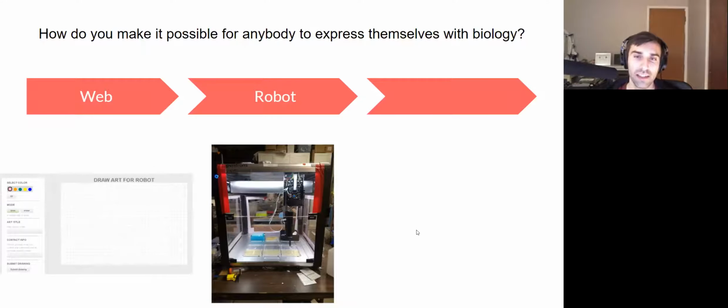That way someone gets back a nice photo of a drawing, and that's really cool. But then they can also spend another hour, maybe in a classroom context, or not if they just want to read about it, asking why all that happened. That's a great start. It's a hands-on experiment for people interested in getting started. But you can also go a little deeper. Perhaps we have some modules that suggest a way to change some code or biology. Do you want that purple? Well, here's a plasmid you could order, and here's a method for doing it, and now you can have purple E. coli as well.